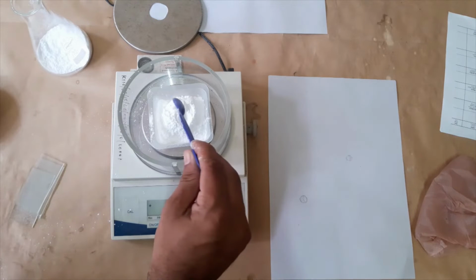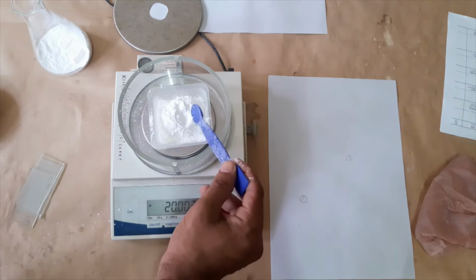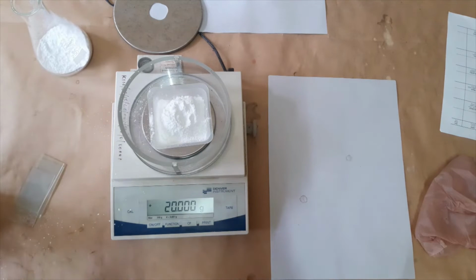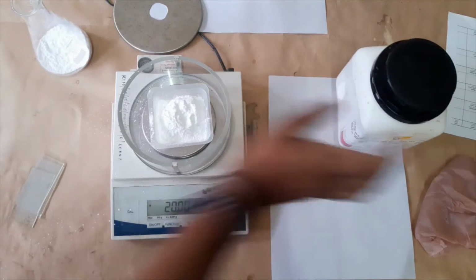Actually, please be careful about the silica. It is very, very tiny. If it goes to your lungs, it will probably be harmful. It will damage your lungs. Okay, we'll close both silica gel bottles.